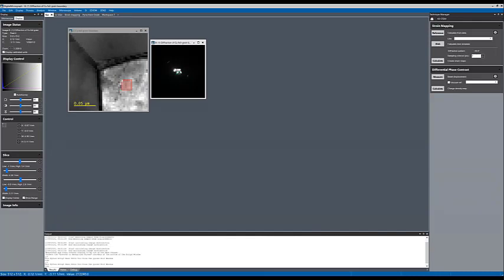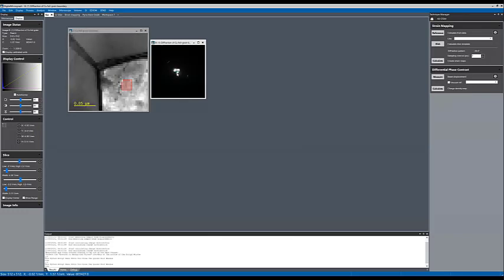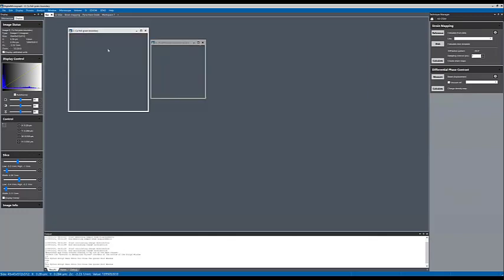This is basically the selection made here by this virtual objective aperture. If you move this aperture on different reflections, here I am on the direct beam, so I'm getting a bright field image. Now I move it to this reflection, and I'm getting a dark field image from this grain. Because I have selected the reflection that is specific to this grain's orientation, this one lights up.